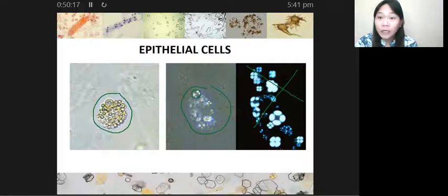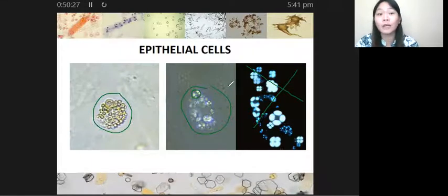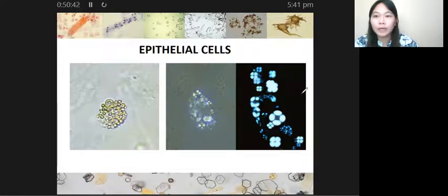So we are sure that this RTE cell is an oval fat body because it contains cholesterol. So lipids yang mga yan. Okay, lipids yung nasa loob ng ating RTE cell.